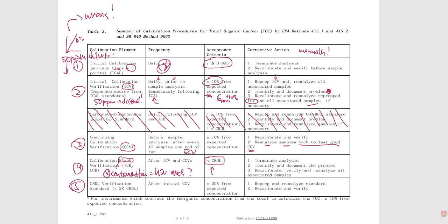Number 5, and give me a break. Prepare the blank. I mean, come on. You squirt some water in a TOC container and you put a lid on it. That's preparing the blank. So don't give me any lip about, oh no, all this work that he makes me do because I've got to make 12 of these. No. You just squirt some water in the vial and you put a lid. You got the easiest job ever if that's what you got to do.